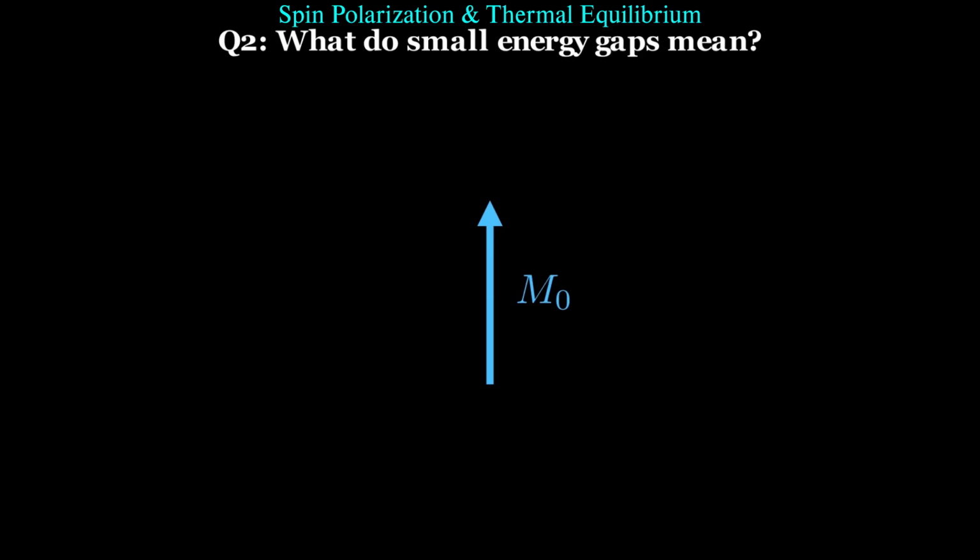So all that we just saw at room temperature, even in a strong magnetic field, that imbalance is usually just a few parts per million. And that's one of the main reasons why NMR is naturally insensitive. Not because the technique is bad per se, but nature just gives us a very small population difference to work with. Now, this also tells us how to classically improve the situation.